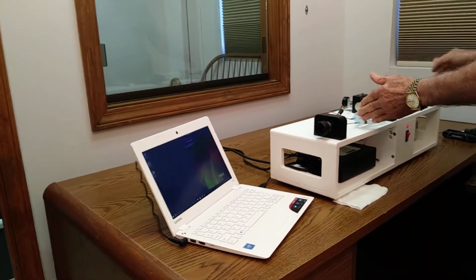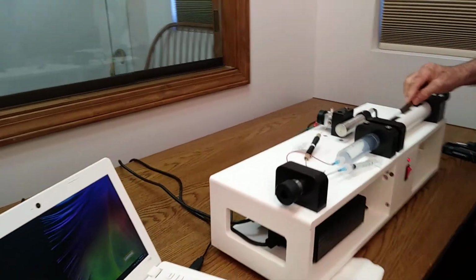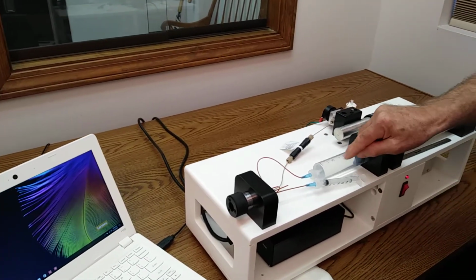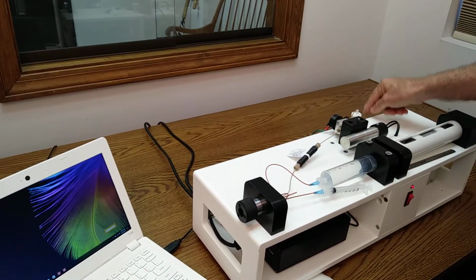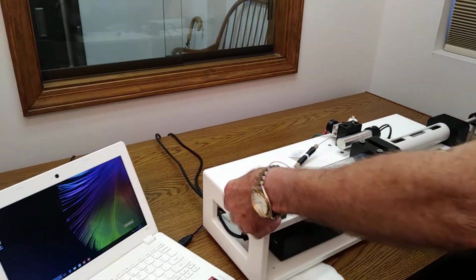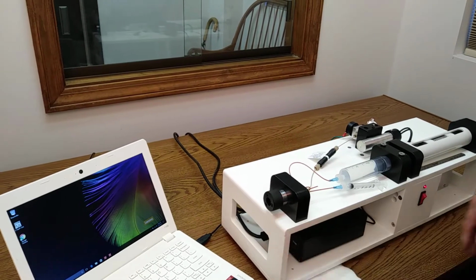We have the pump set up. We have 50 millimeters of compression here. And when we have pressure here, we have flow going through here. We have it dripping back here. So as far as we can tell now, everything is as it should be. We have this rotated toward us.